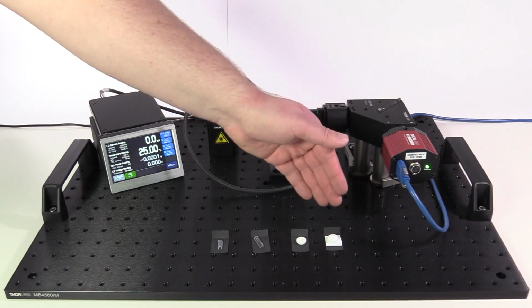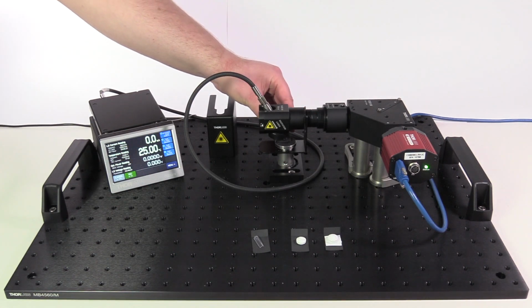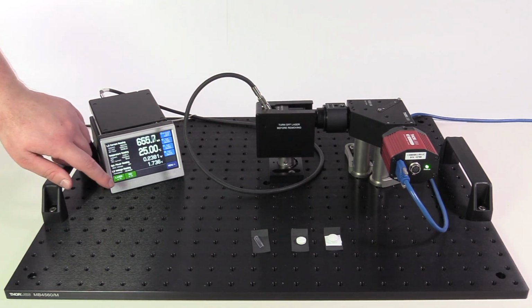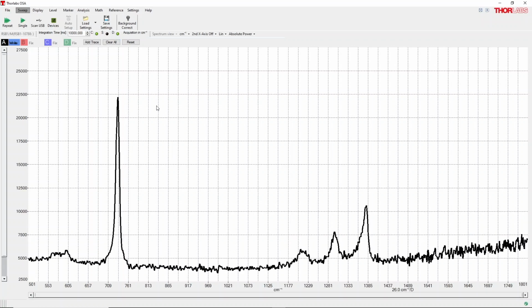First, we will check these solids. We have two different plastic tubes and aspirin pills, both with and without their packaging. The first one we place on our sample holder is a plastic tube made from Teflon. We start our measurements with an exposure time of 10 seconds. This is sufficient to achieve a good spectrum of the material. In the black trace here, we can already identify several distinct peaks, like this one, or these three over here. Now we can load a reference spectrum.